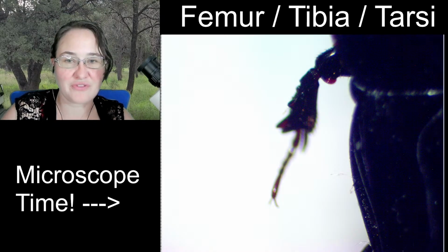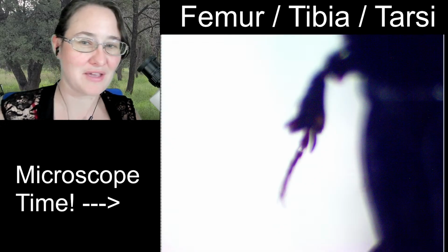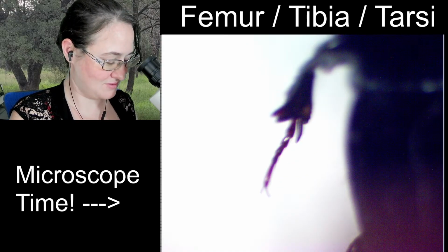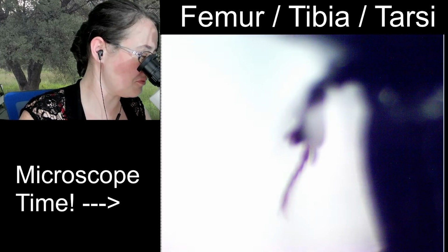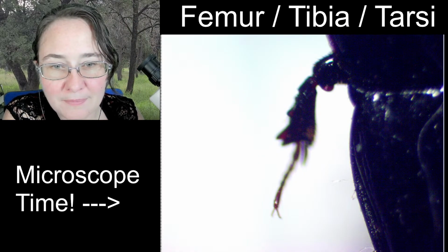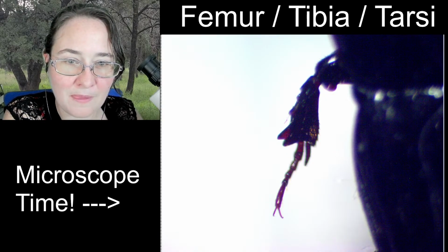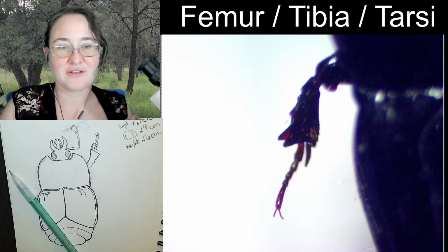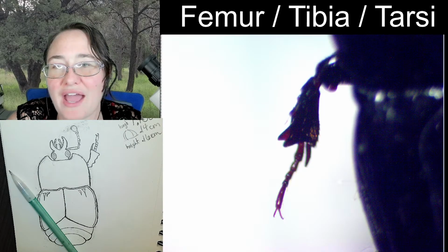I need to refocus my microscope so that when it's in focus, my computer is also in focus. I'll calibrate my viewer to the computer. Ah, very good. Don't move anymore. Hopefully it pauses right there. Yes! So, that is a pretty decent image of what we're looking at.